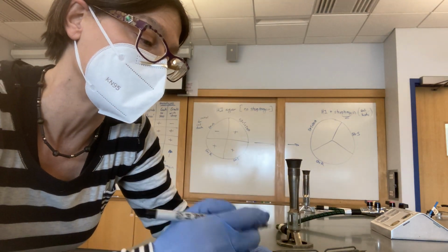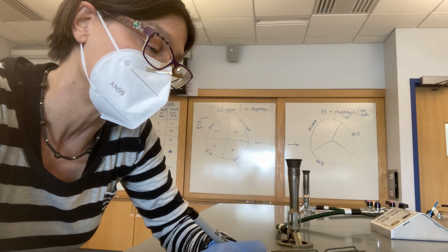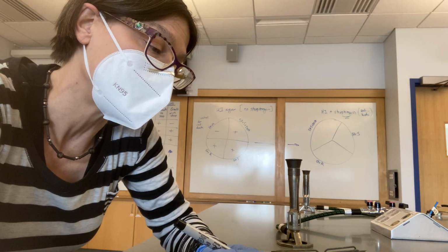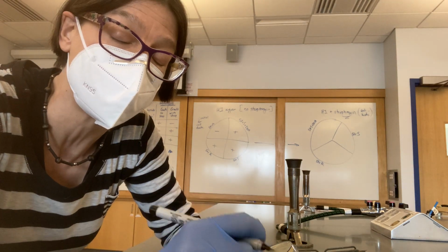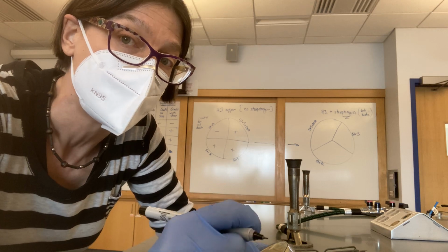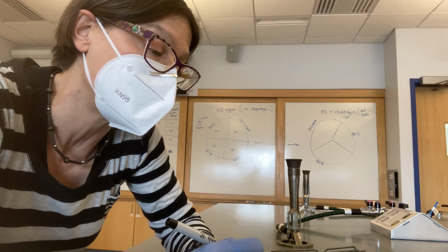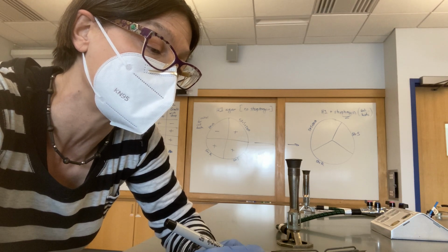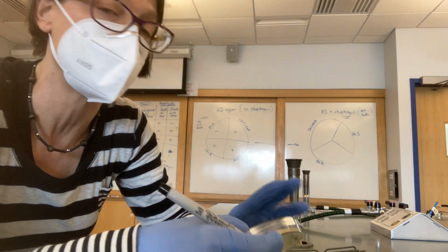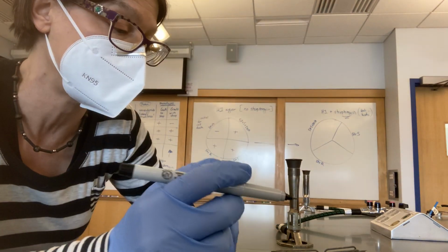And I'm going to label the thirds with my name around the edge. One of them will be STRR for that strain. The other will be STRS for that strain. Notice the use of the word strain with an N and not strand, which is a common mistake. And then we're going to do STRS plus DNA. That's going to receive those cells that I hope were genetically transformed. So there are my labels running around the edge so that they don't obscure growth in the media.